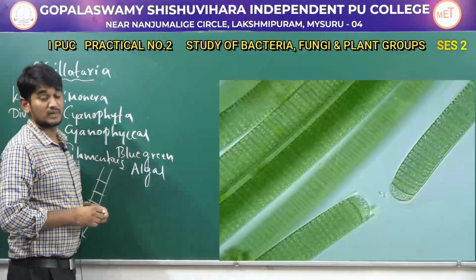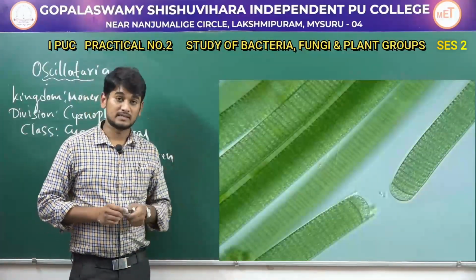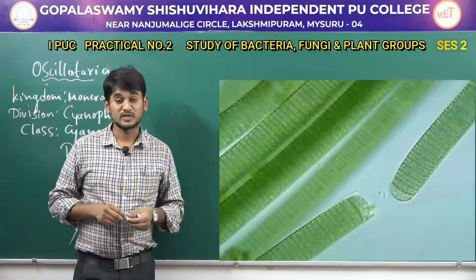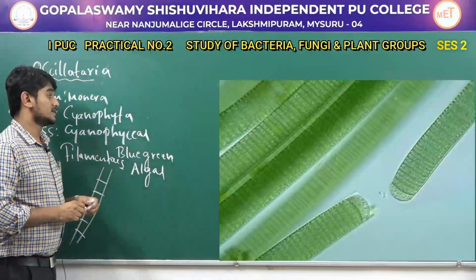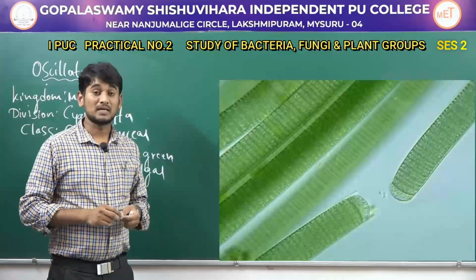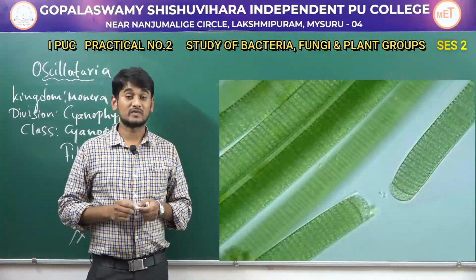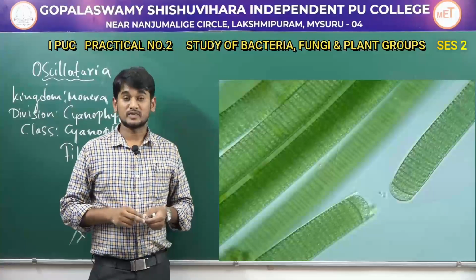Each cell has definite cell walls and it shows oscillatory movement in fresh specimen. So these are all about Oscillatoria.